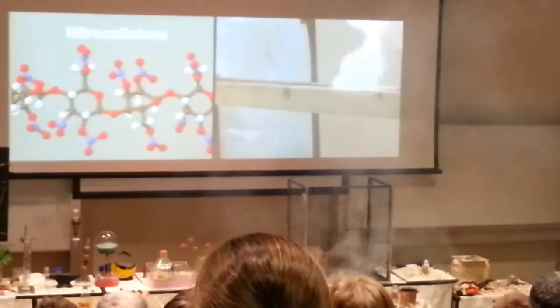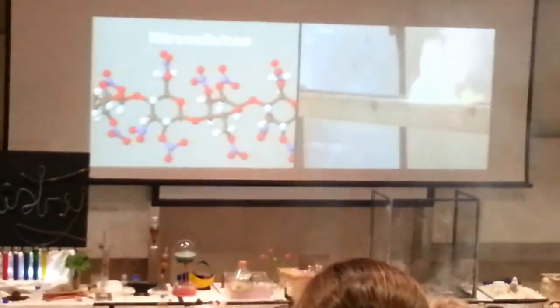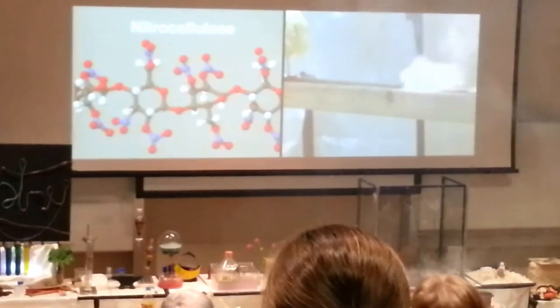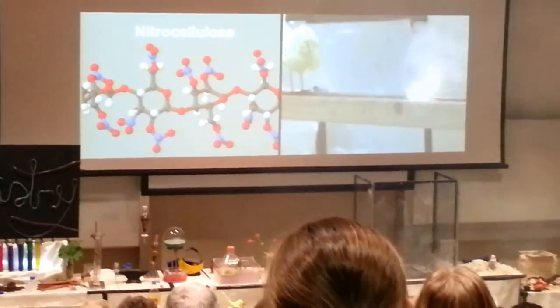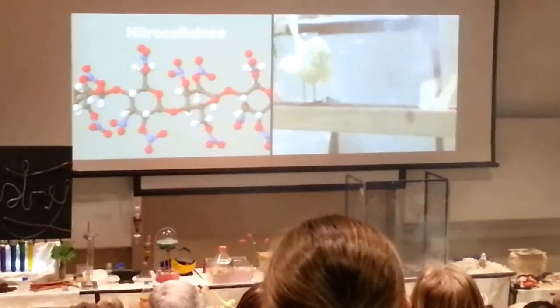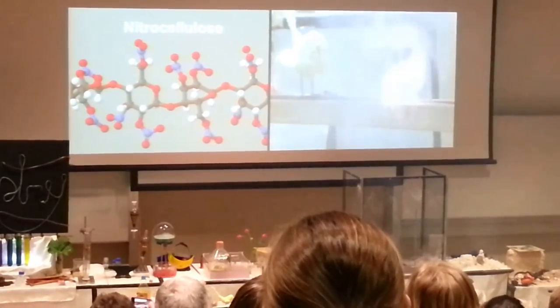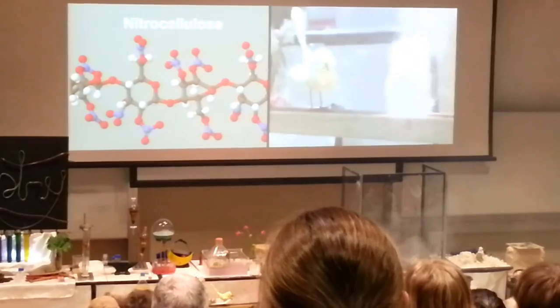Oh, is it going to make it? Is it going to go? Is it going to go? It's still going. This really is a pretty rubbish gunpowder. The purple colour, by the way, is potassium that's in the potassium nitrate. Excited potassium. Anyway, keep going.